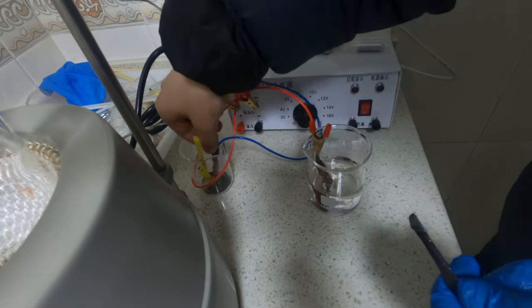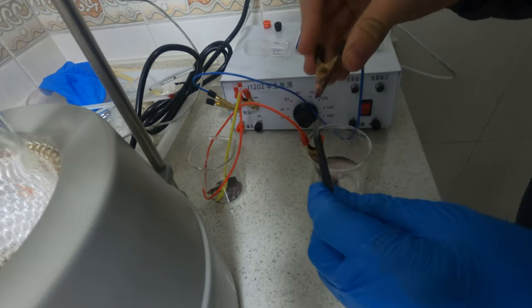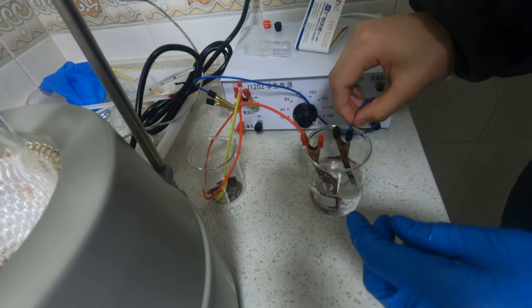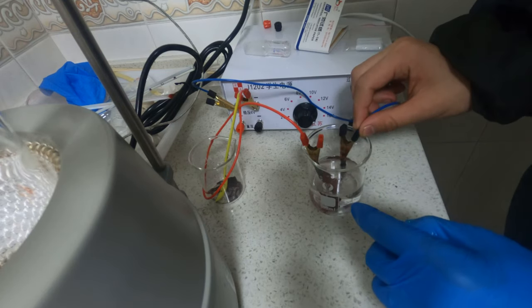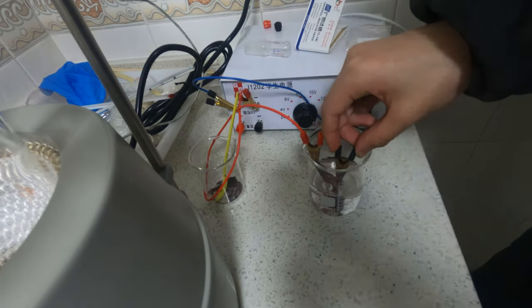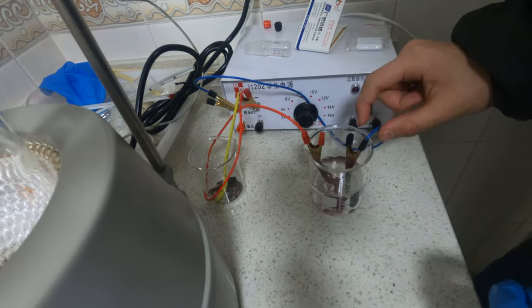Pour the dilute sulfuric acid we made last time into the container. Connect the lead bar to the positive charge. For the cathode, you can use copper, graphite, or any other inert electrodes. Make sure you connect the lead bar to the correct charge, or everything will go wrong. After an hour, you can see some black color on the lead bar. That's our lead dioxide anode.